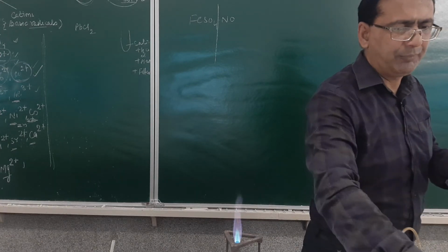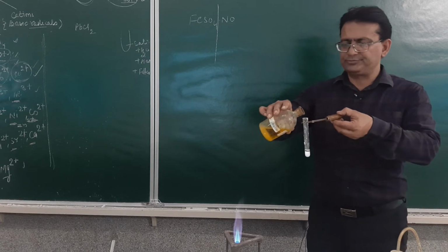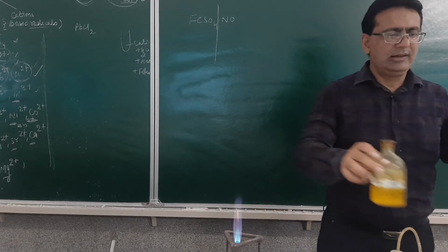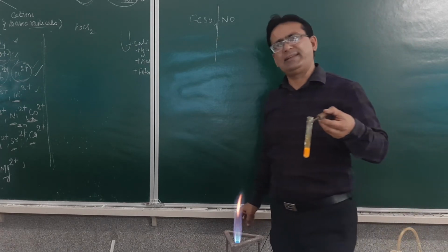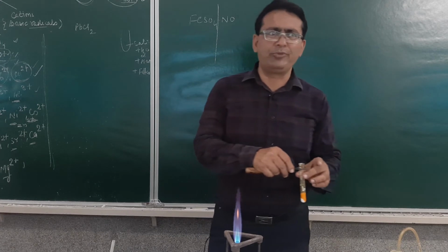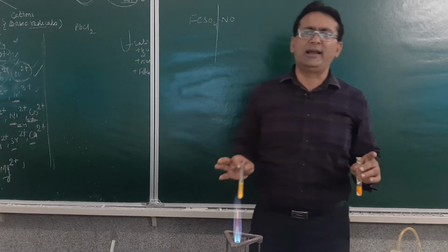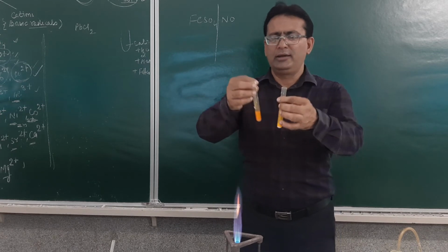When we add potassium chromate to this, here again the yellow color will be obtained. You may see. It means lead is present in the given salt. So which is the cation you are observing? Lead. Which is the anion you are observing? Nitrate. So the salt will be lead nitrate. What was the aim? To analyze the salt. Which salt have we analyzed? A lead ion and this.